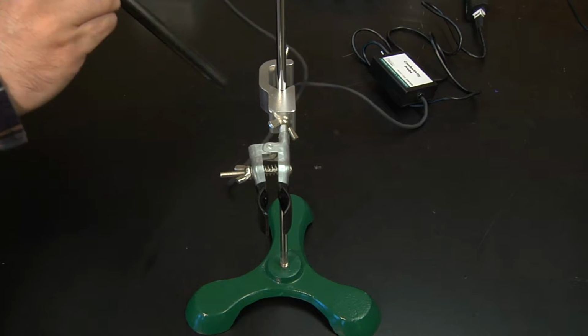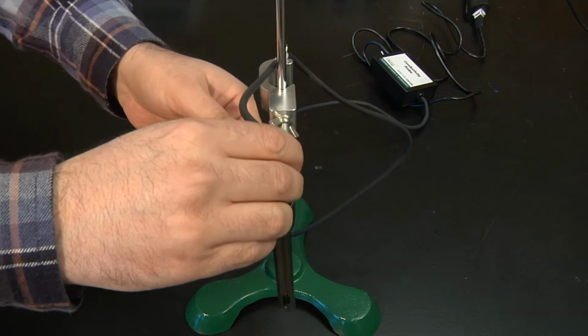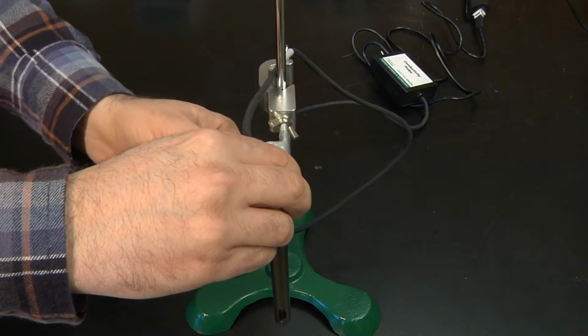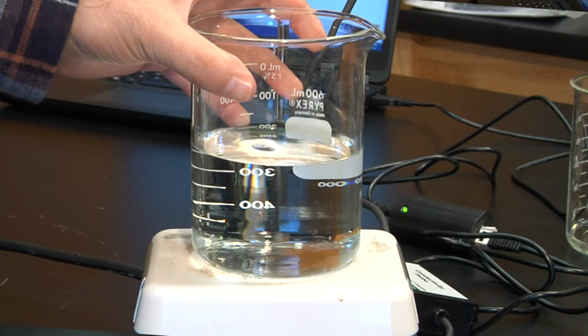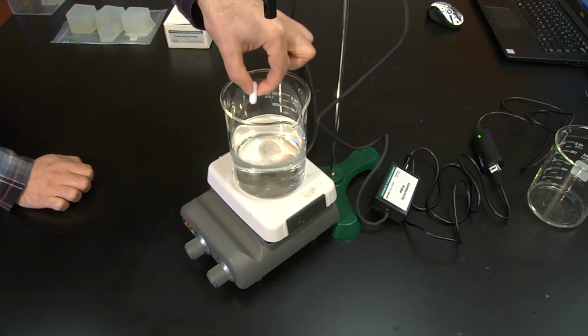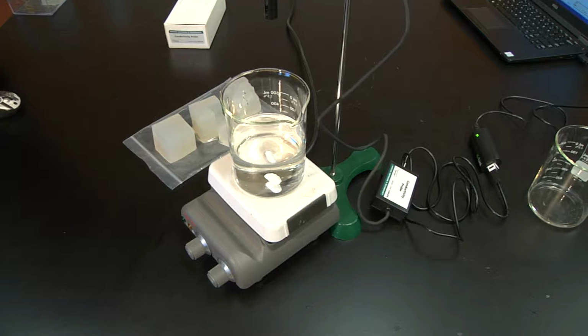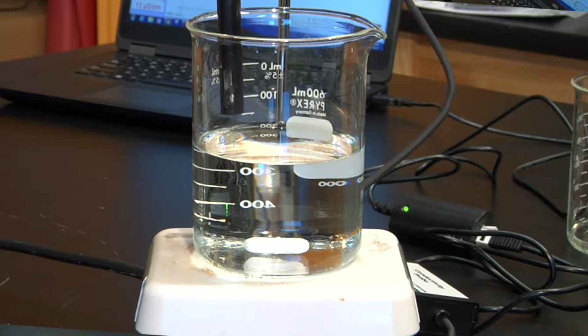After cleaning your conductivity sensor, secure it using the clamp on your ring stand. Then place your beaker with water on top of the magnetic stirrer and place the stir bar inside the beaker. Submerge the conductivity sensor in the distilled water in the beaker by lowering your clamp.